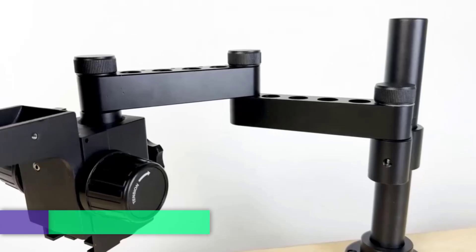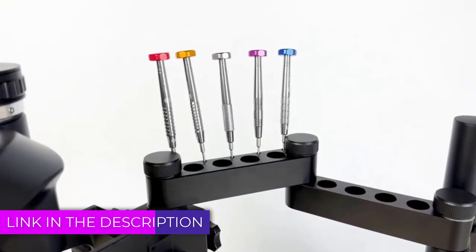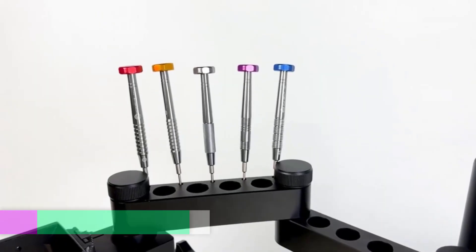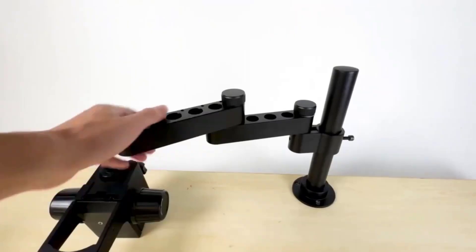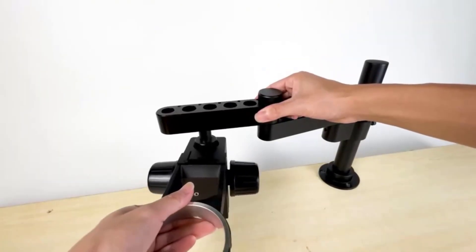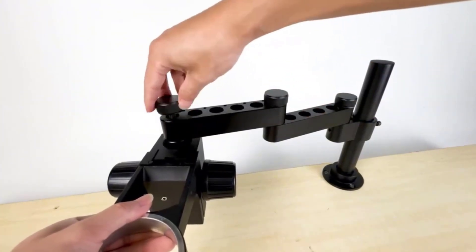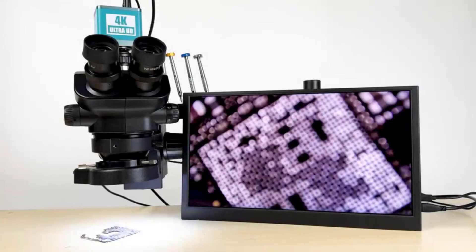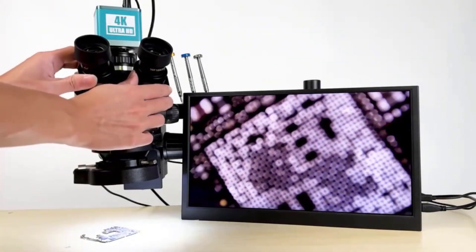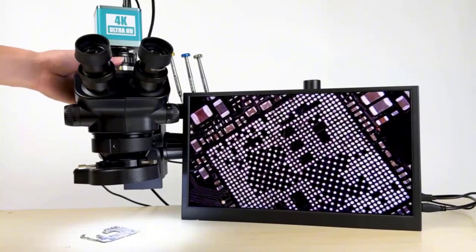A stereo trinocular microscope is an advanced optical instrument designed for detailed examination and analysis of three-dimensional objects. Unlike traditional microscopes that offer a flat two-dimensional view, stereo microscopes provide a dual optical path, enabling users to perceive depth and see objects in a more lifelike three-dimensional form. The trinocular aspect refers to the third optical port, which allows for the attachment of a camera, making it ideal for capturing images or recording videos of specimens during observation.